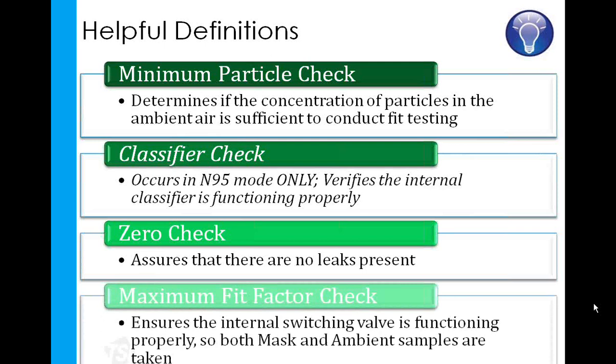The final daily check setting is the maximum fit factor. This tests the internal switching valve to make sure that it is fully switched from ambient or blue tubing to mask or clear tubing.